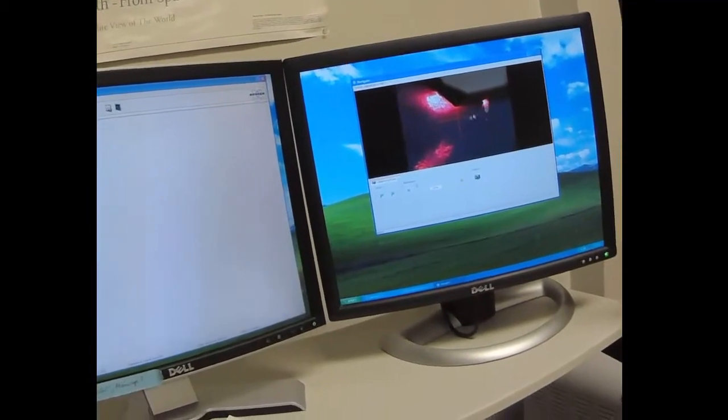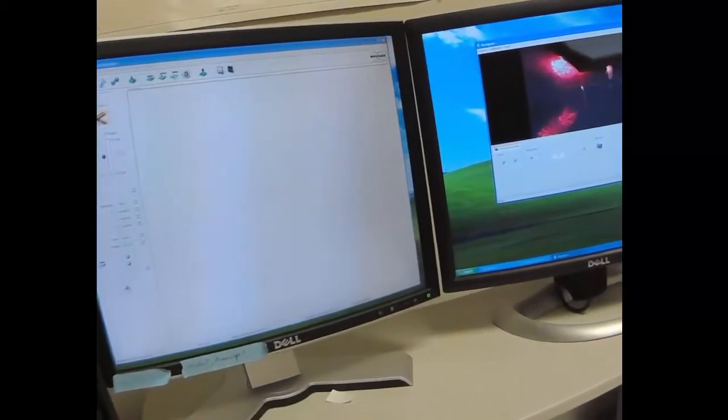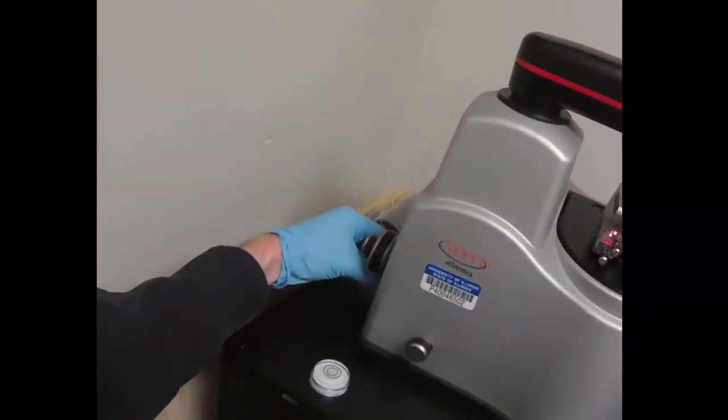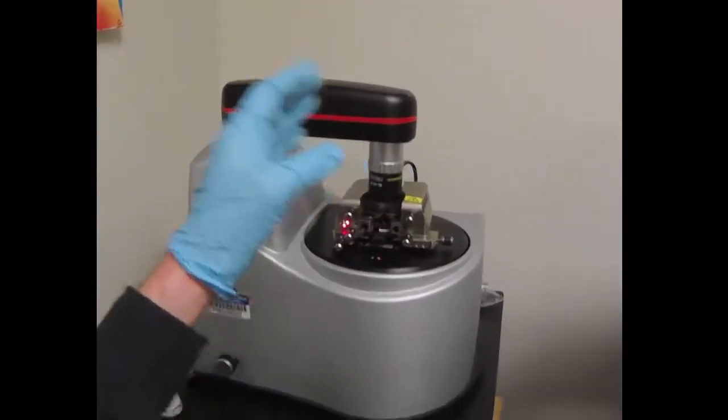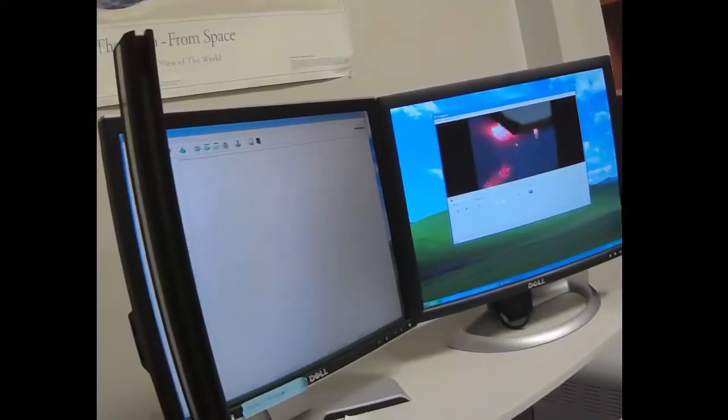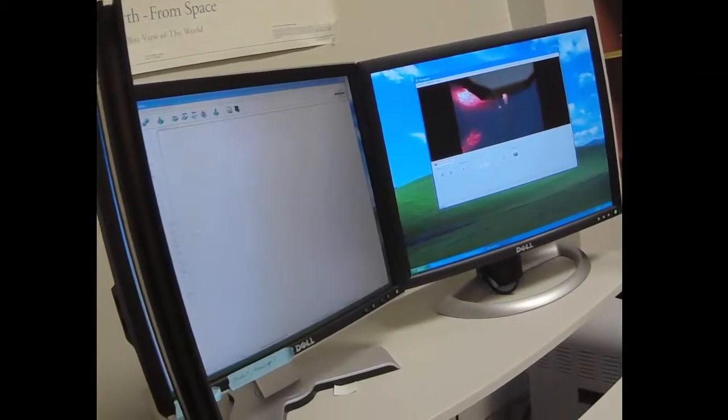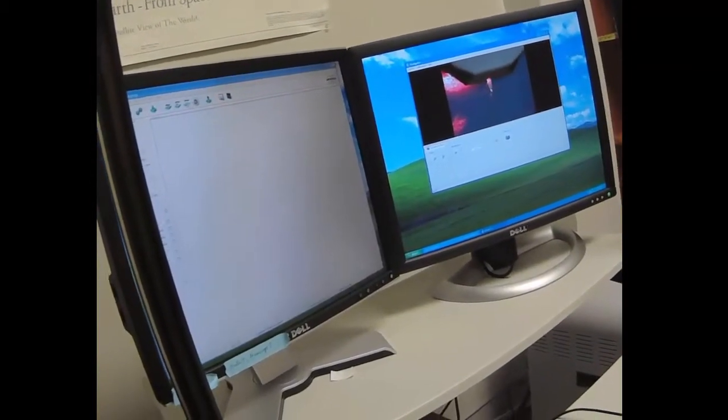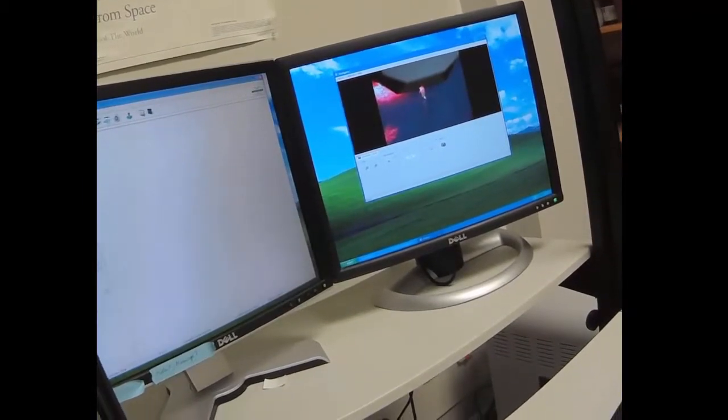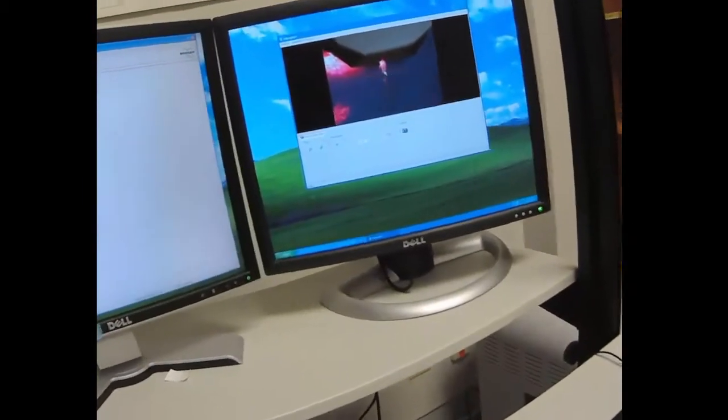It is not lined up with the cantilever. So when I zoom in, I won't be able to see the cantilever. So I'm going to move this position. These two levers, these two knobs, move the optical camera position. Again, gently rotate these knobs. You could get to the edge of them and strip them out. So now I've centered the cantilever.